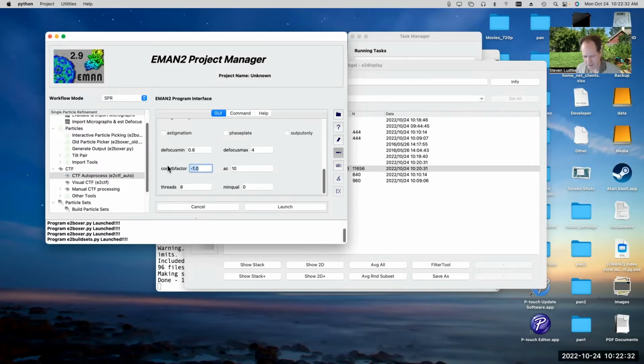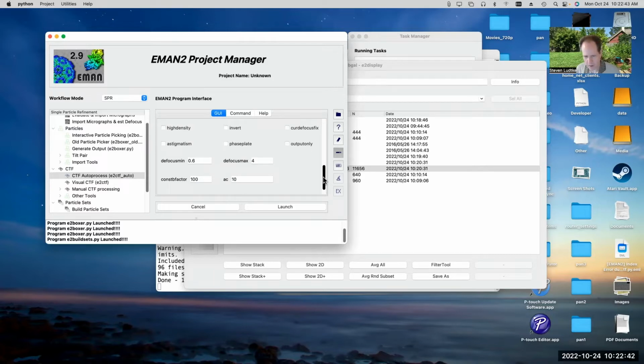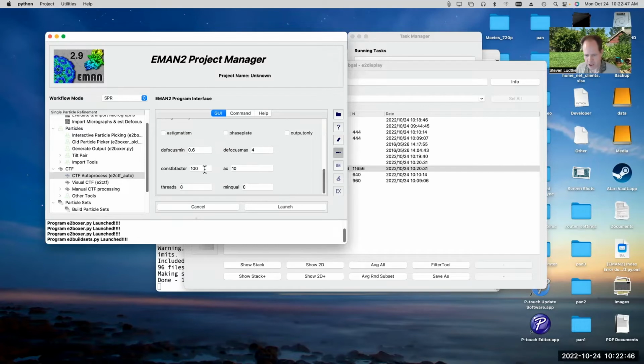Sometimes setting const b factor doesn't really do much of anything, but if we set it here, then the parameters, if we try to visualize things later, will look more self-consistent. In other words, leaving this as -1 won't do any harm in our final reconstruction. It's just visualization in the intermediate steps where it's convenient to have a constant value.